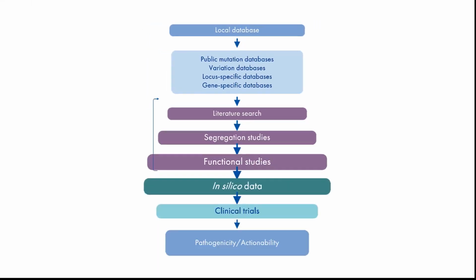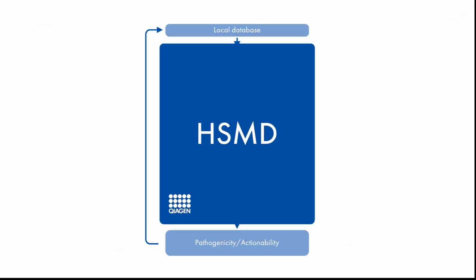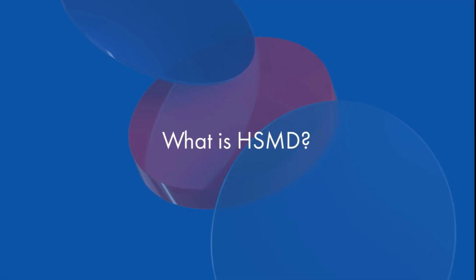In this video, we'll show you how you can empower your somatic bioinformatics pipeline with just one comprehensive database called HSMD, helping you streamline the variant annotation process and confidently recommend biomarker-matched therapies in a fraction of the time. But first, what is HSMD?